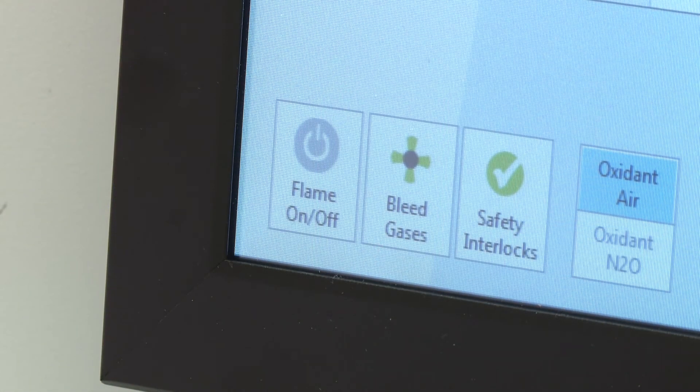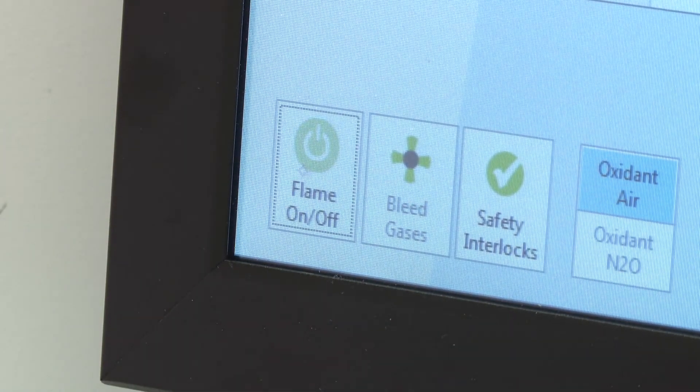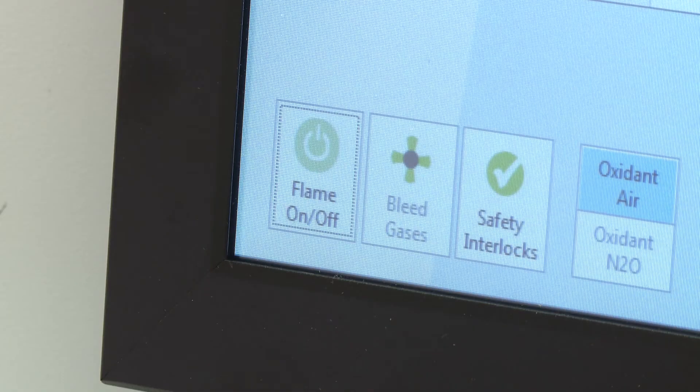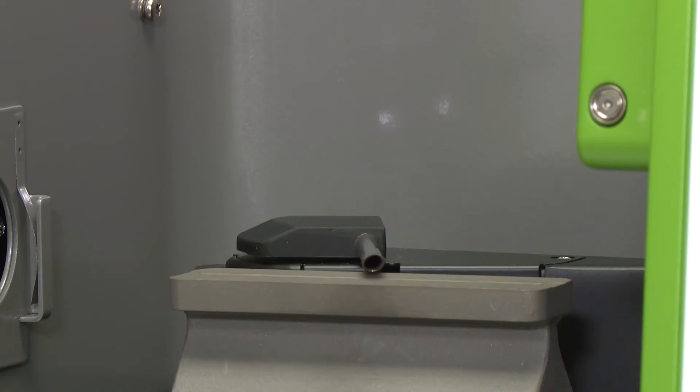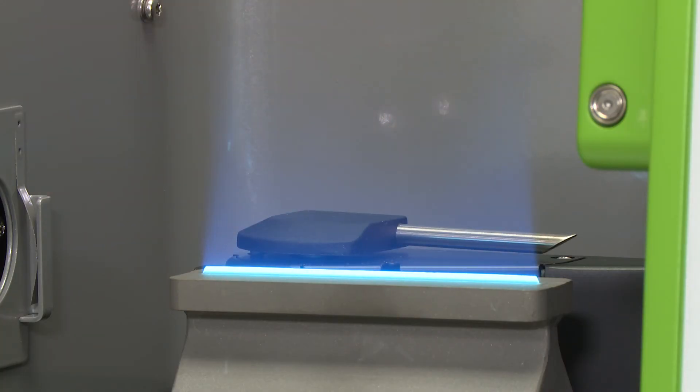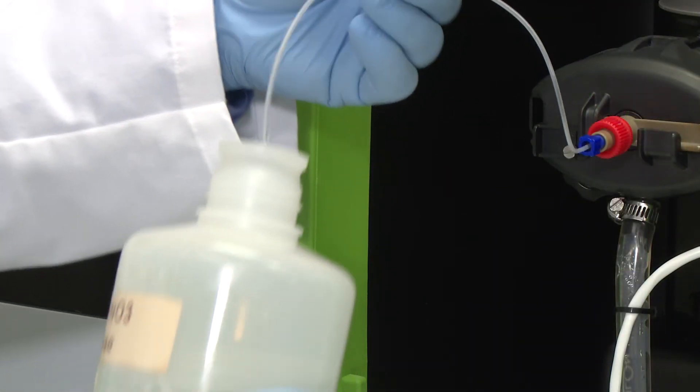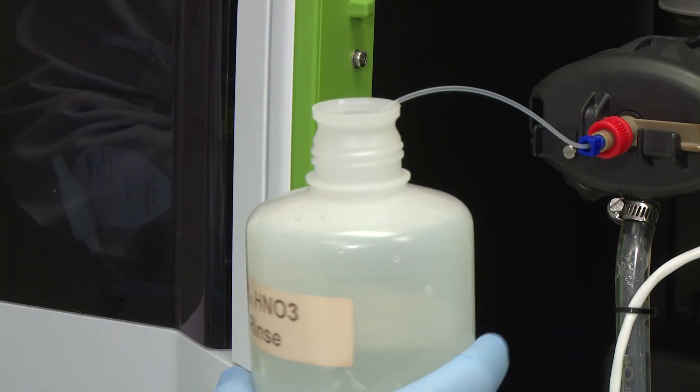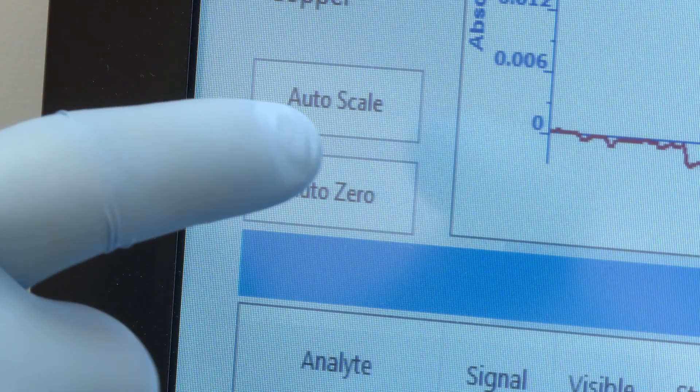Once your vertical position has been found, go to the continuous graphics and turn on your flame. Aspirate the blank solution. When the signal is steady, click on the Auto-zero graph button.